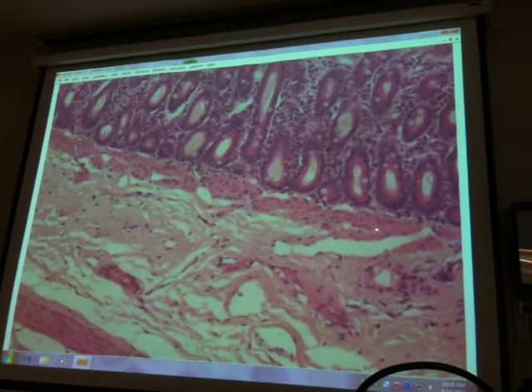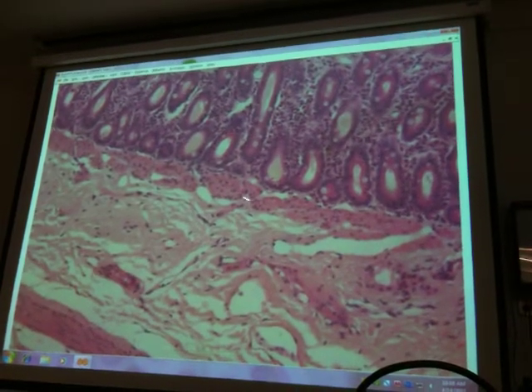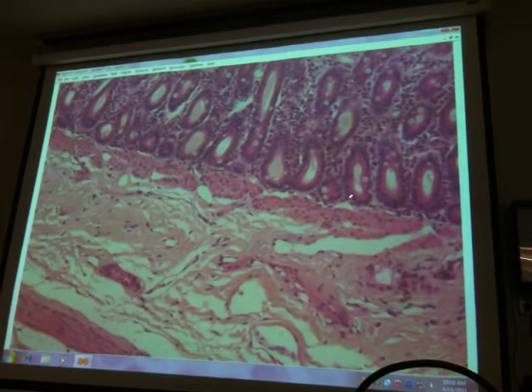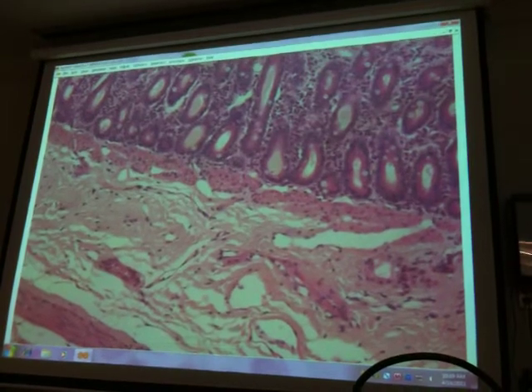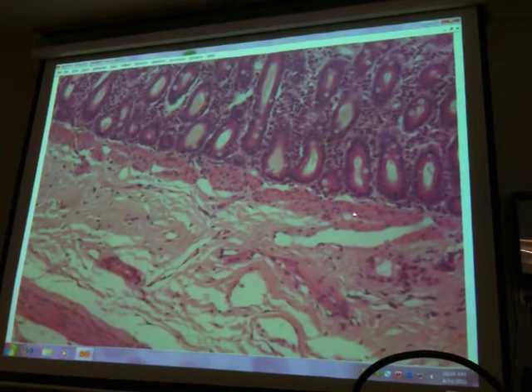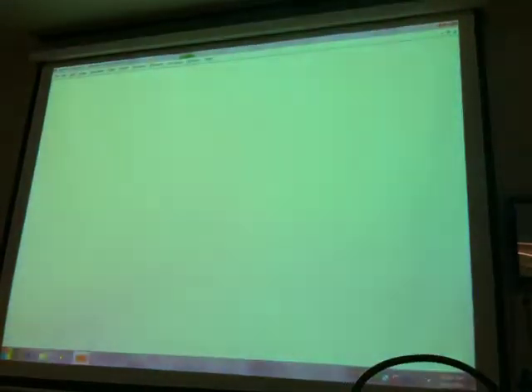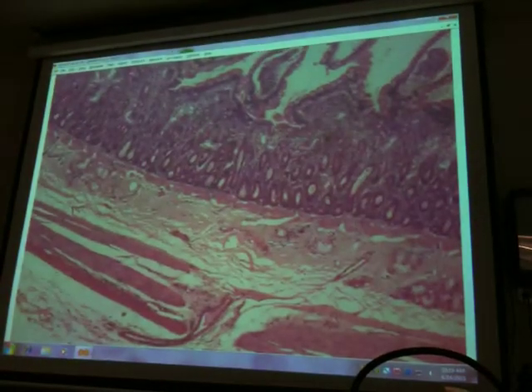Here is the undercap of the mucosa, if you will, the muscularis mucosa. Okay? Pretty thin layer of muscle. Now, this muscle layer is what helps contribute to the folding of the mucosa. All right, we get deep to that mucosa, especially to the muscularis mucosa, and we're in the submucosa. Okay? So I'm going to go to scanning power, because if we're in the duodenum, as I told you we are, then we should see something in the submucosa.